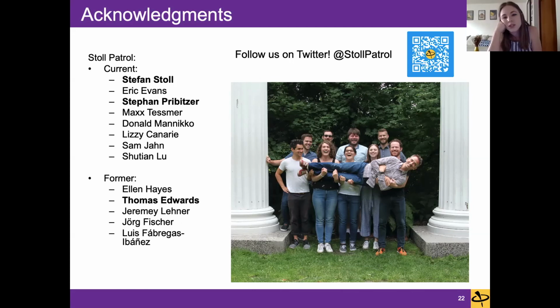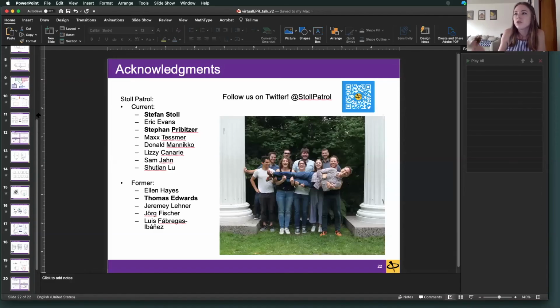Yeah, I would say yes, because if you look at the posteriors themselves, it shows really on a nanometer scale what the method is predicting for that parameter value, and so the mode is what you would generally take as the value, but then you could look at the entire spread of the distribution and say plus or minus so much. So then you would take something like full width at half maximum or something like that.